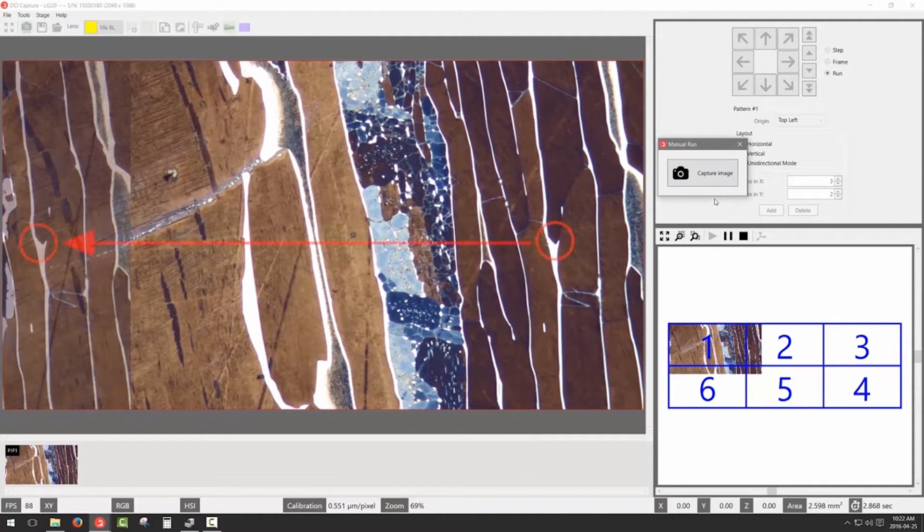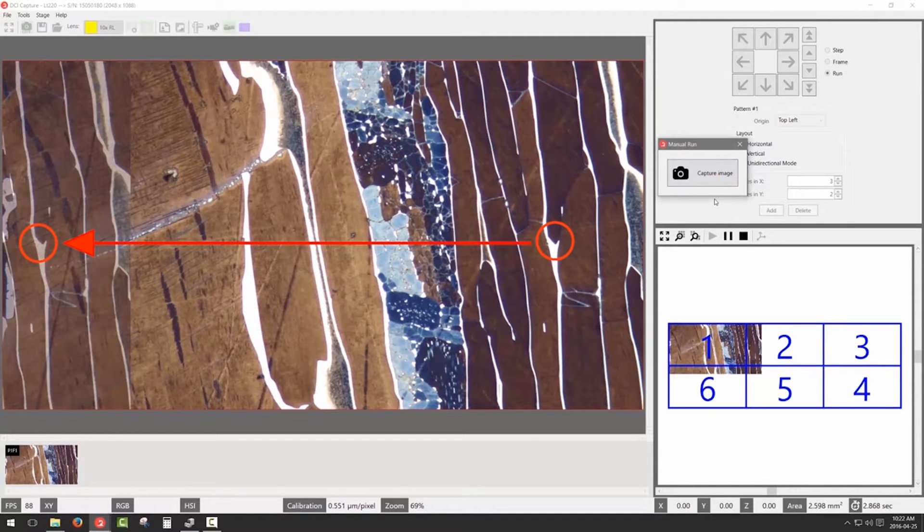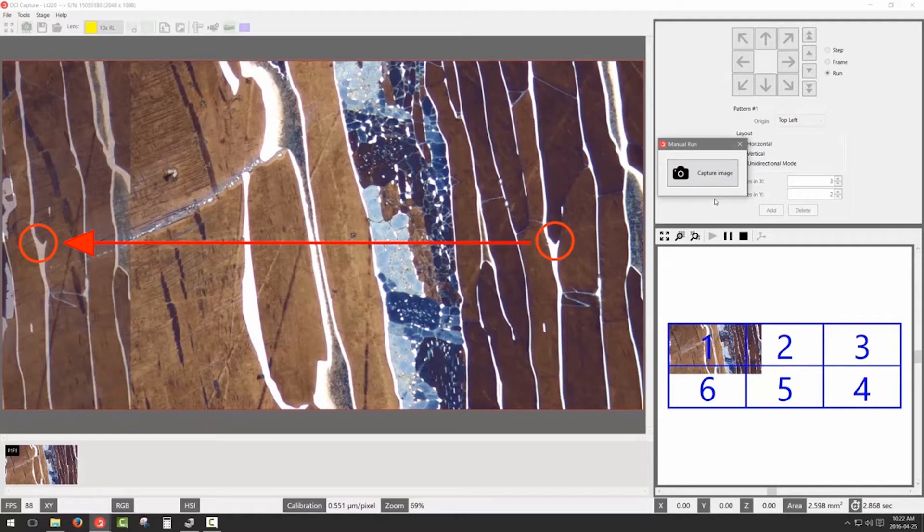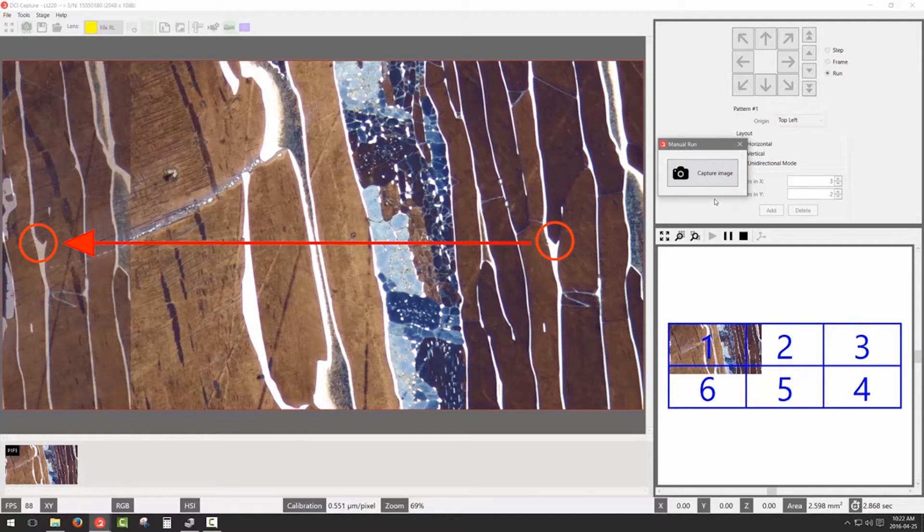With a sample with a very complex structure, such as this one, it can help to focus on only a small amount of detail, like what is circled in red in this example.